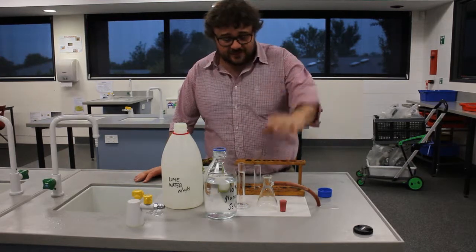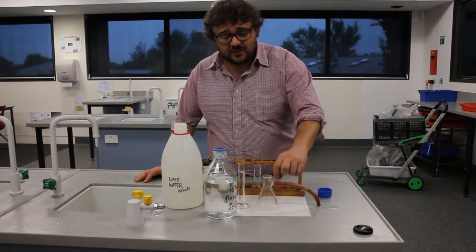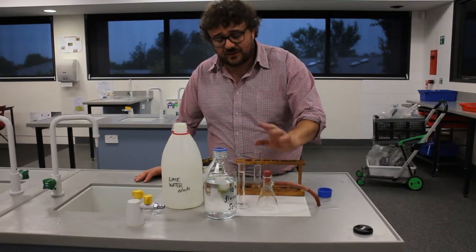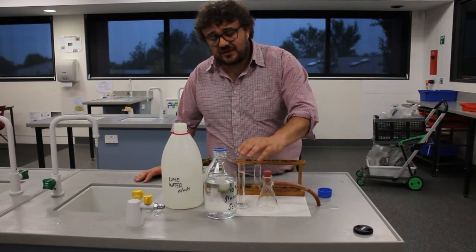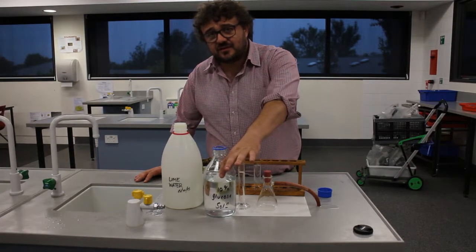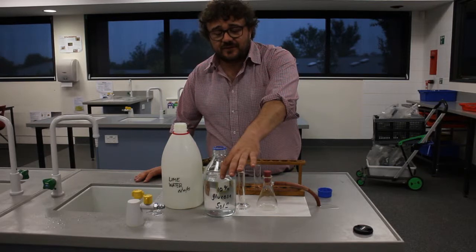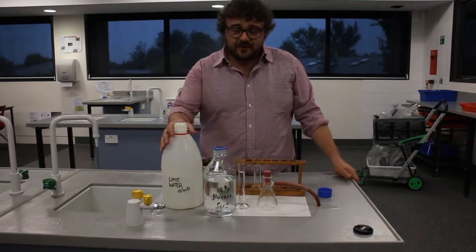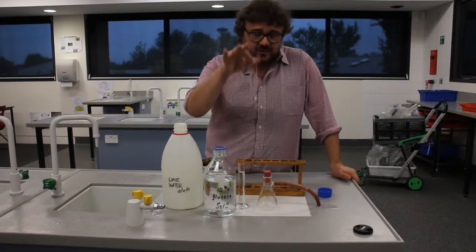What we have here is an Erlenmeyer flask, or conical flask, with a sidearm and a rubber bung that will go in there. We have a measuring cylinder which has 25 mils of 10% glucose solution — that is our source for the fermentation. Right here we have lime water, and here we have a test tube full of lime water.